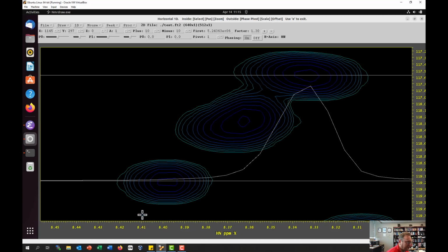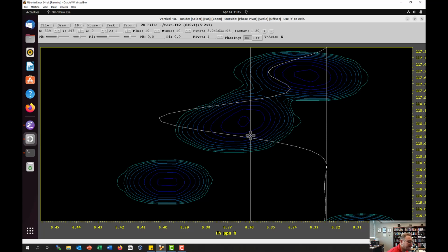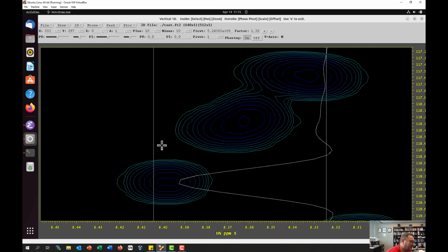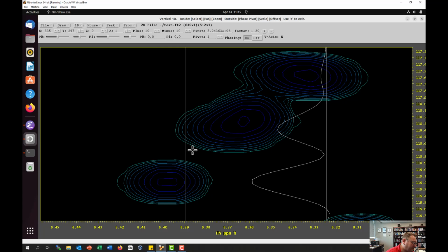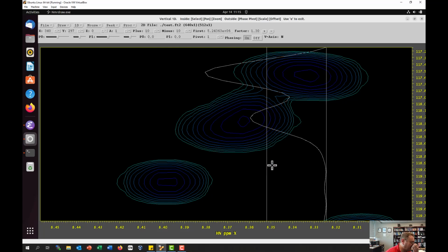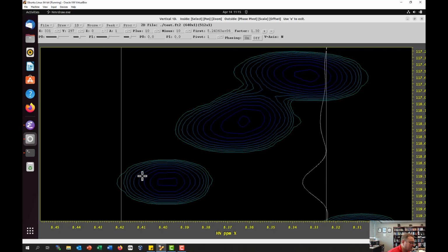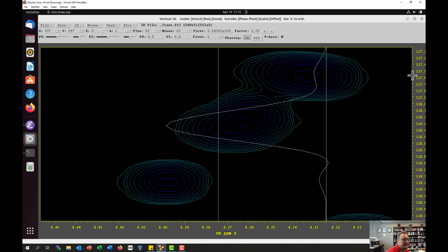And so that shows up for all of these. But notice that if I go to vertical mode, this still looks pretty smooth. There's a little bit of difference there, but for most of these peaks, it's actually pretty smooth. Notice also that my horizontal line is jumping, because that's jumping from the actual points, and so I don't have a nice smooth x-axis anymore. I have a very discrete x-axis.